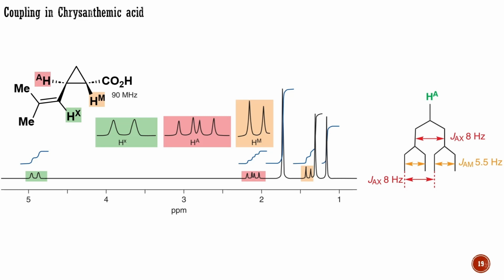DD. The smaller coupling constant can be read off from the separation between lines 1 and 2, while the larger coupling constant is between lines 1 and 3. The separation between the middle two lines is not a coupling constant. You could view a double doublet as an imperfect triplet where the second coupling is too small to bring the central lines together. Alternatively, look at a triplet as a special case of a double doublet where the two couplings are identical and the two middle lines coincide.